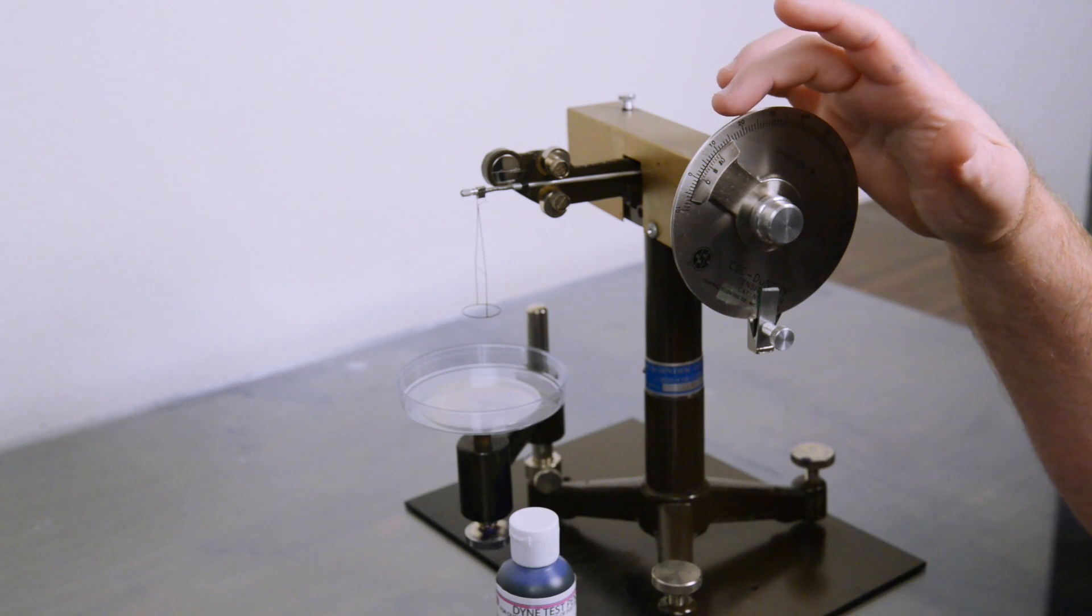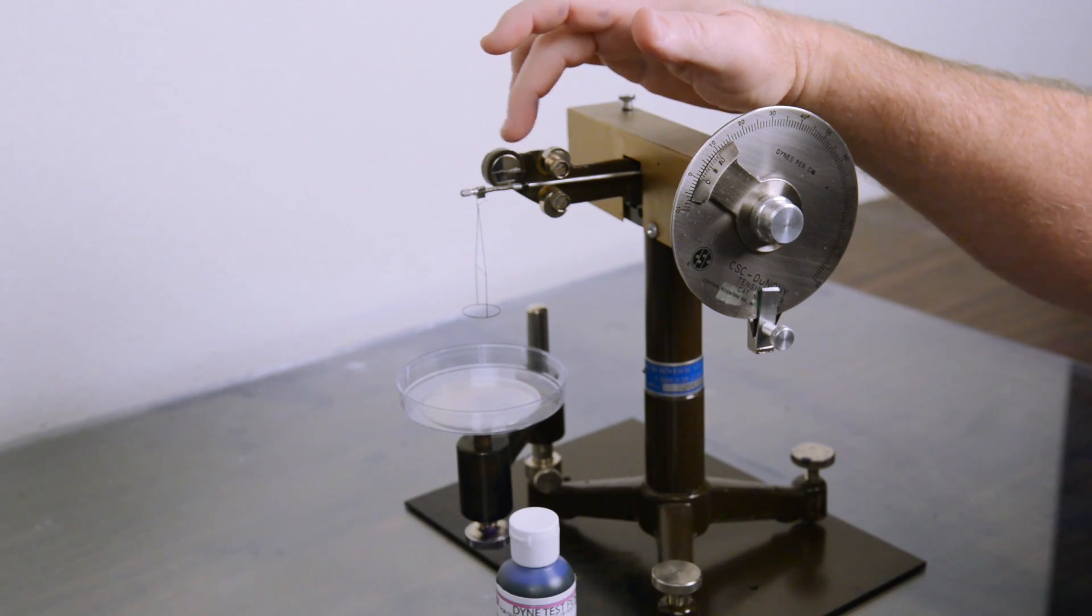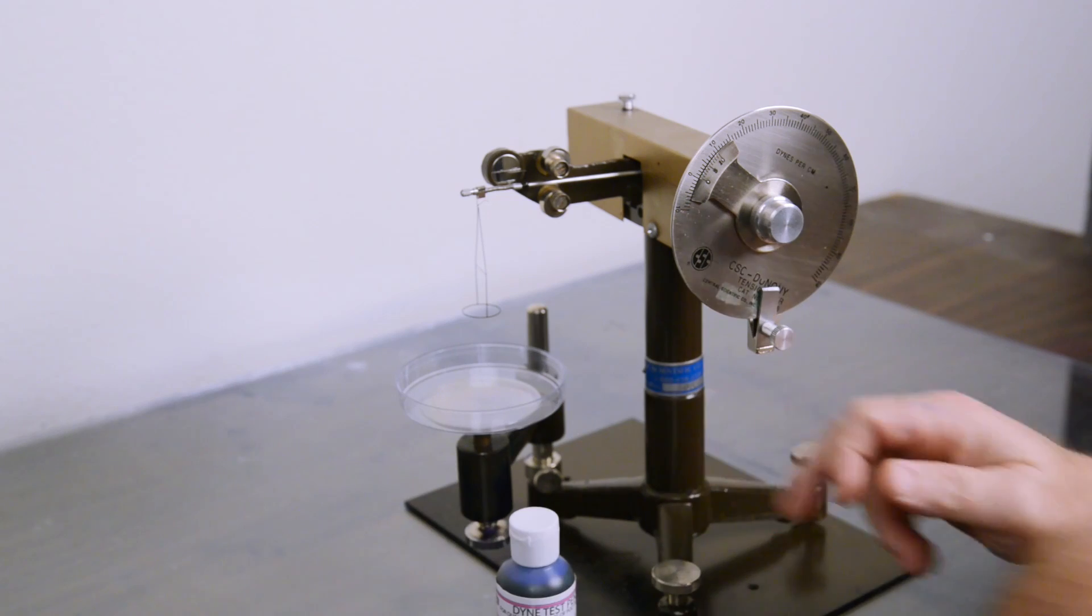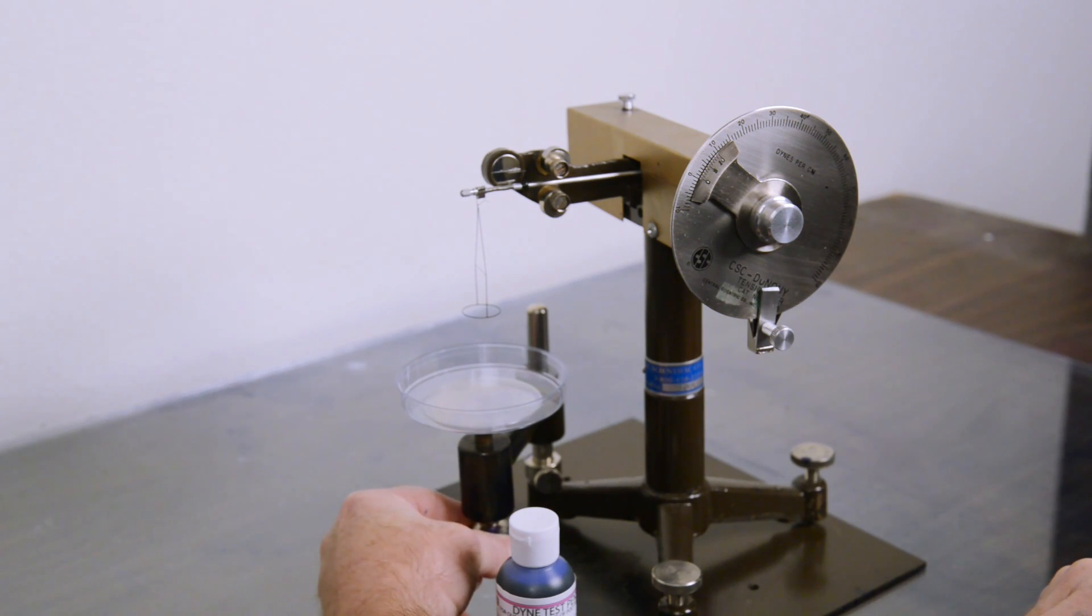The dial is zeroed out, the mirror line of the rod is lined up, clean petri dish, and the arm is raised all the way up to the top.